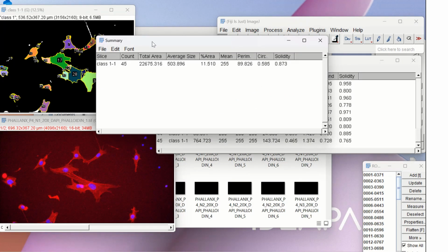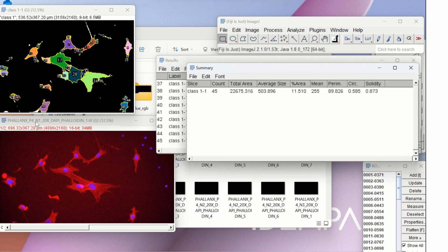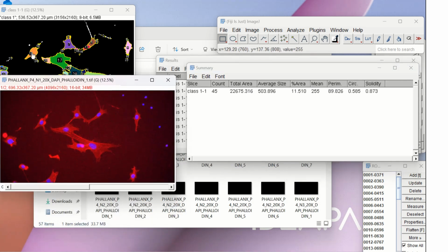Oh wow, that looks really cool. That mask selection, but this is definitely not accurate. So that's what I mean. You have to play depending on your cell size. Like it's saying there's like 4 cells right here, when really it's just 1.